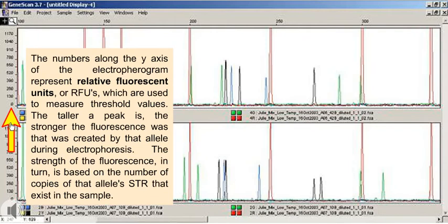The numbers along the y-axis of the electropherogram represent relative fluorescent units, or RFUs, which are used to measure threshold values.